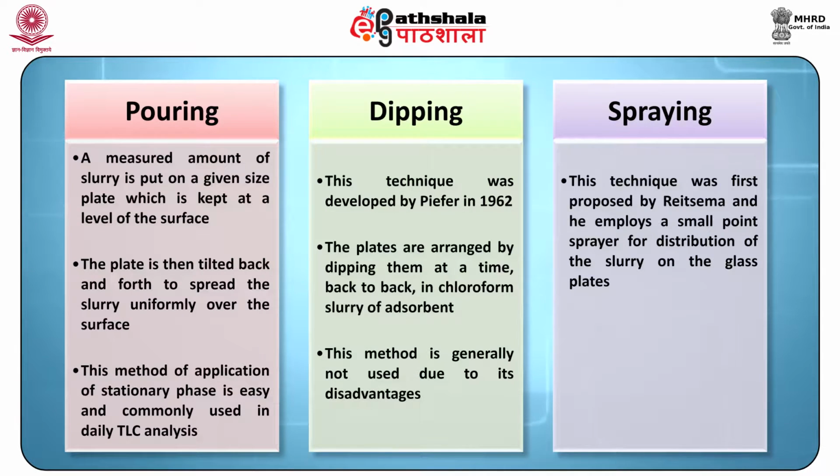The steps involved are pouring. In this technique, a measured amount of the slurry is put on a plate of given size which is kept on a level surface. For the slurry to spread uniformly over the surface, the plate is moved back and forth.